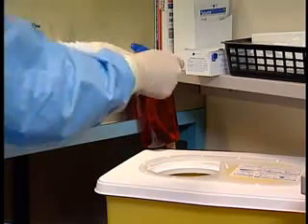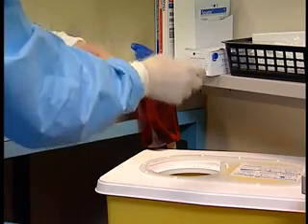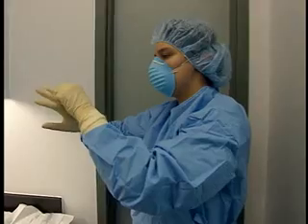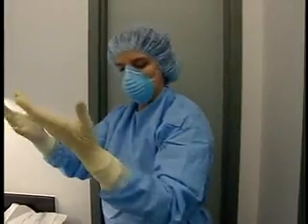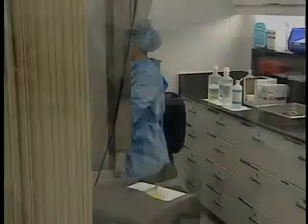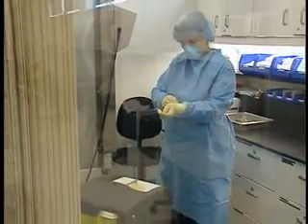The inner glove is tucked under the cuff of your gown, and the outer glove is placed over the cuff. Discard gloves at once if they are punctured, torn, or contaminated. All gloves must be changed after 30 to 60 minutes of continuous work with antineoplastic products. We also recommend that you wear a surgical mask at all times during the handling to prevent any contamination of the products.